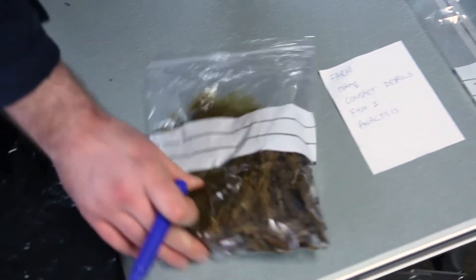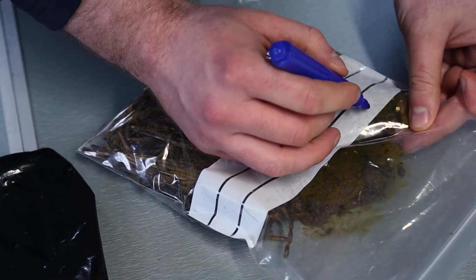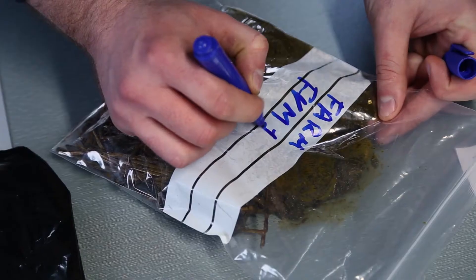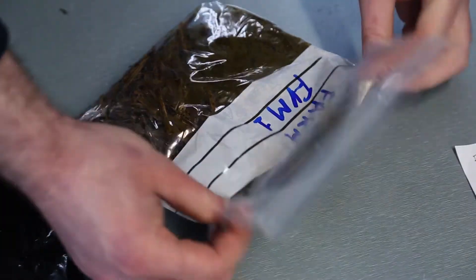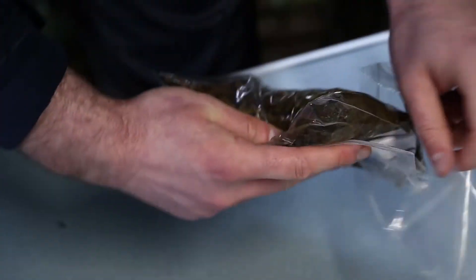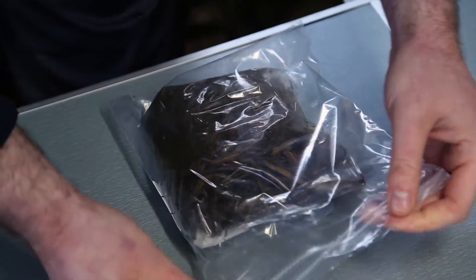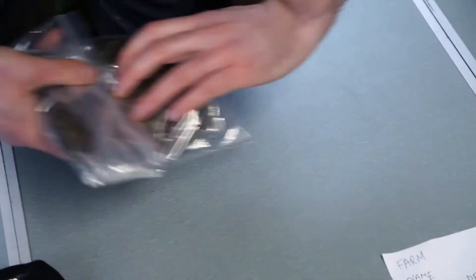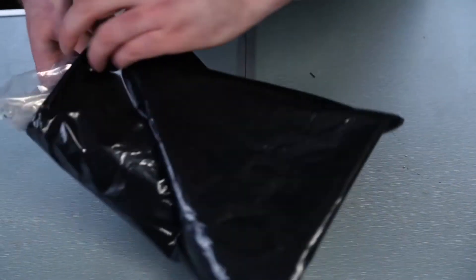At this stage it is crucial for us to know where the manure came from. We give the details of the heap and the farm it came from. Obviously to avoid any spillage, we double bag it.